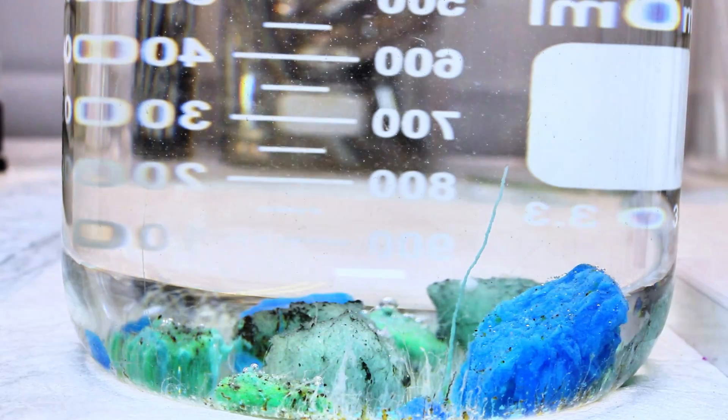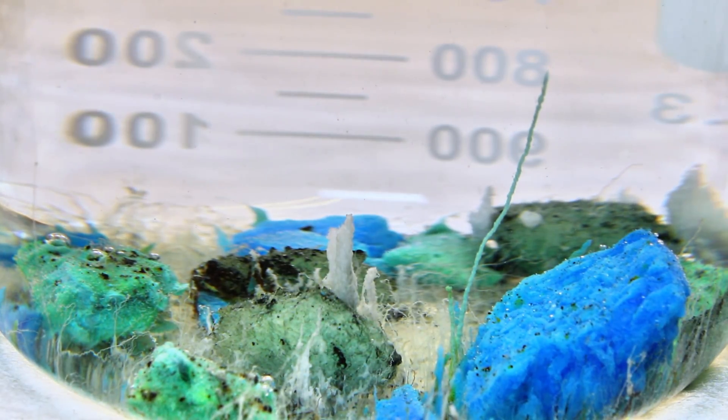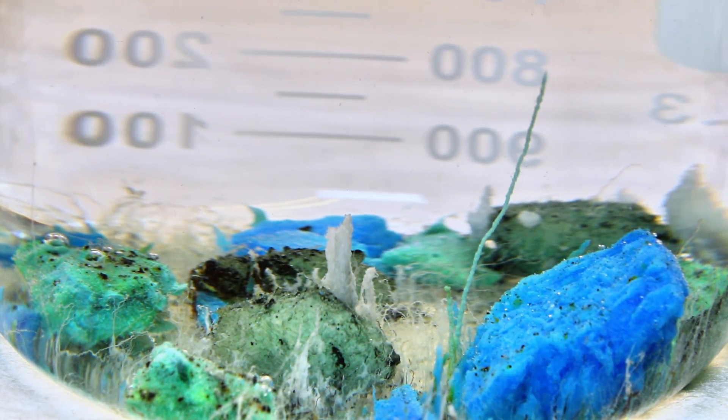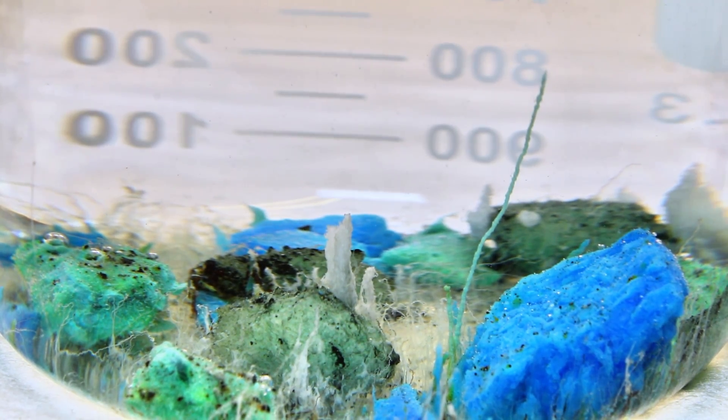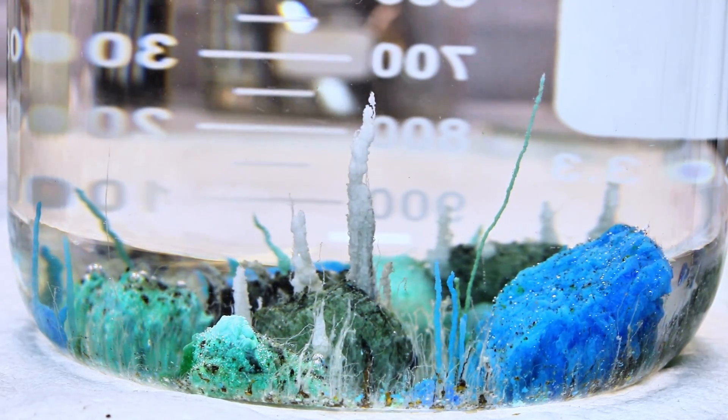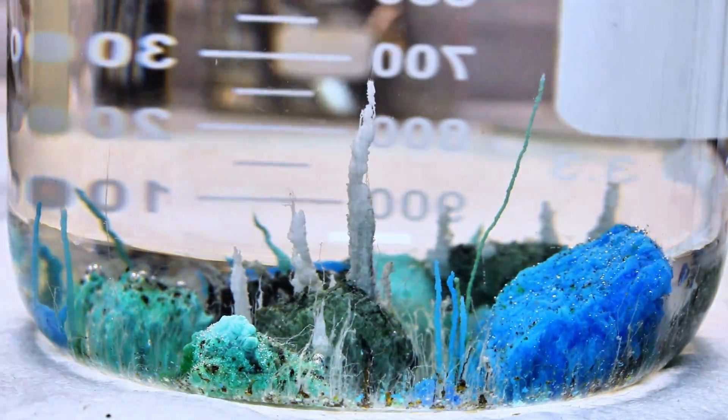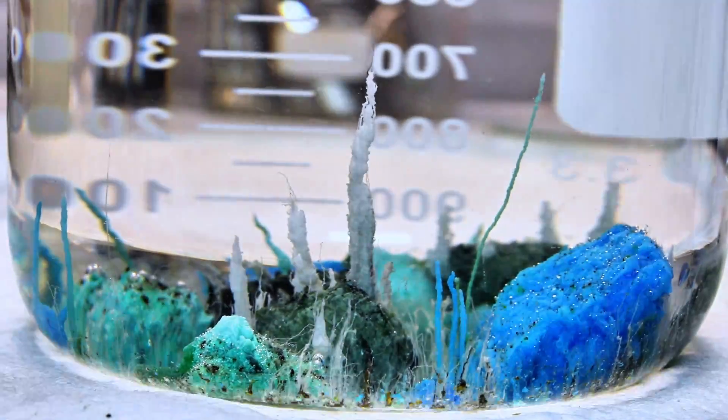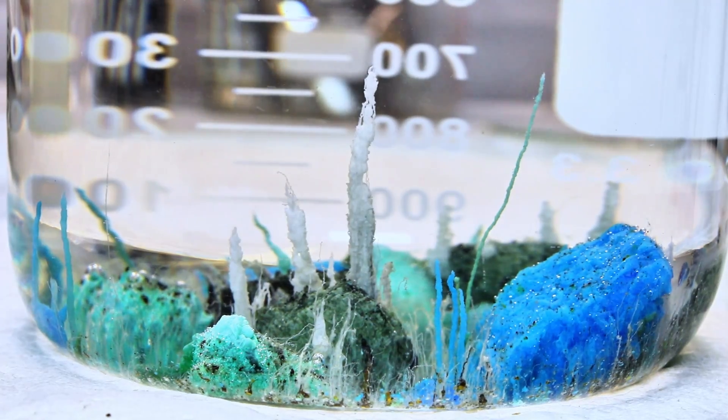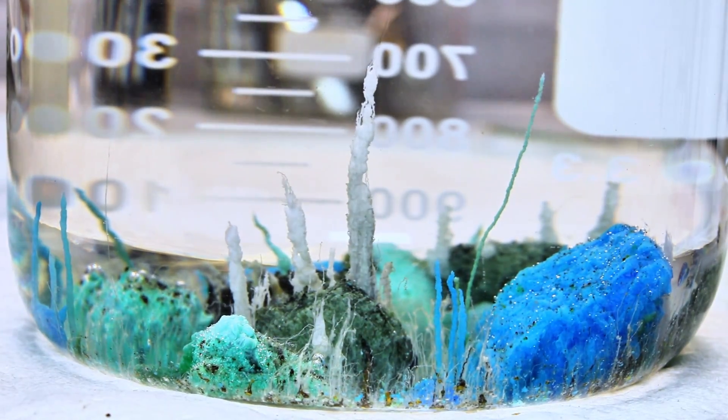Just spitballing off the dome here, but for example, you could add borax to make borosilicate growths. You could also add different alkali or alkaline earth metals such as lithium, calcium, magnesium, barium, or even strontium to make more complex crystals.